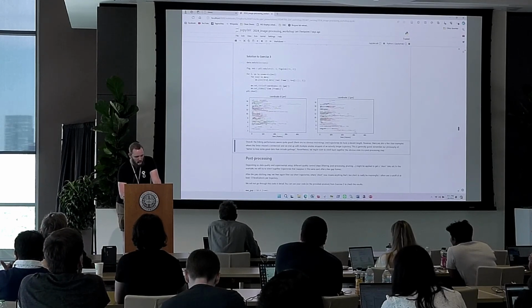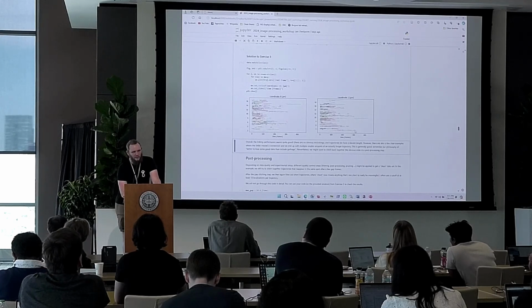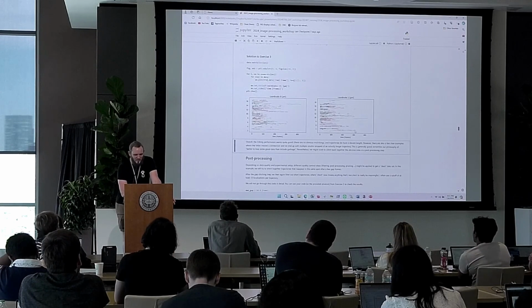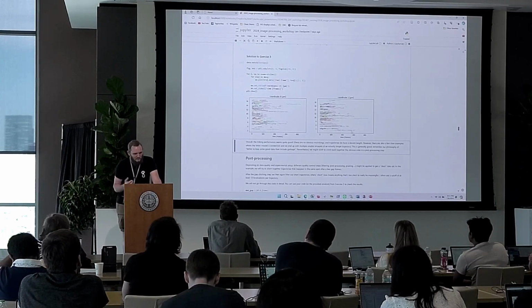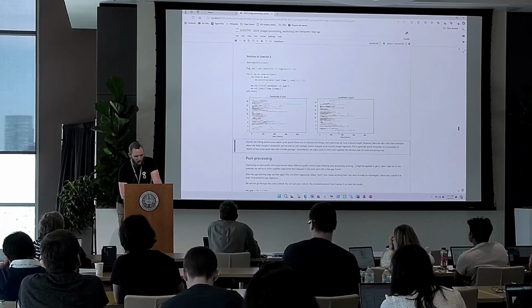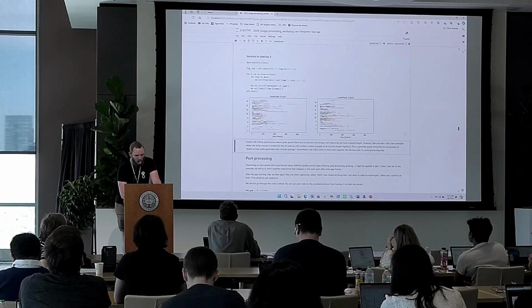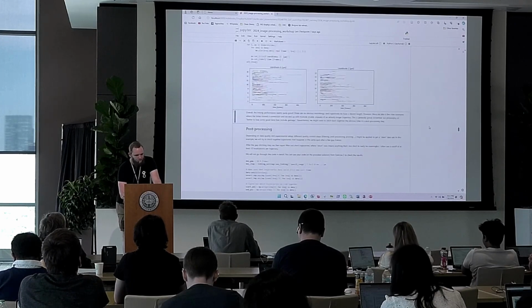There's also things like this thing down here where we have multiple shorter trajectories that are very much right behind each other. And it kind of looks like this is the same particle. We could go back into the movie to check whether it actually looks reasonable to link these together. For now, we're going to be happy with saying we see this here in coordinate 1. We also see it in coordinate 0. So very likely these are actually the particle disappearing for something.